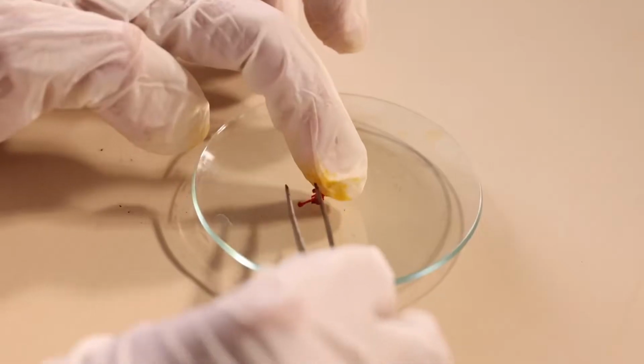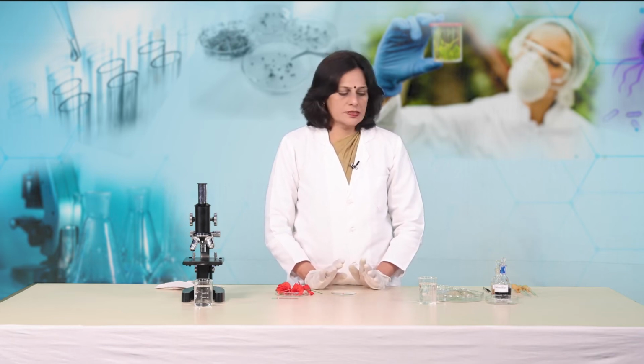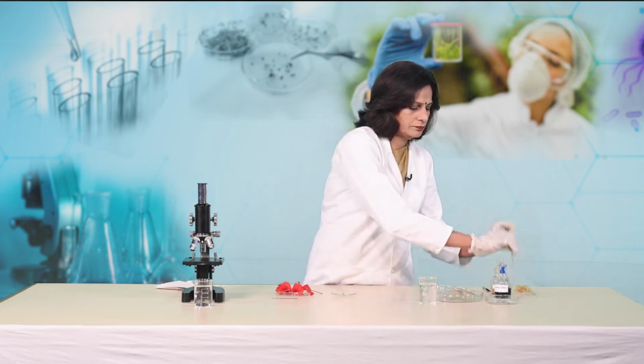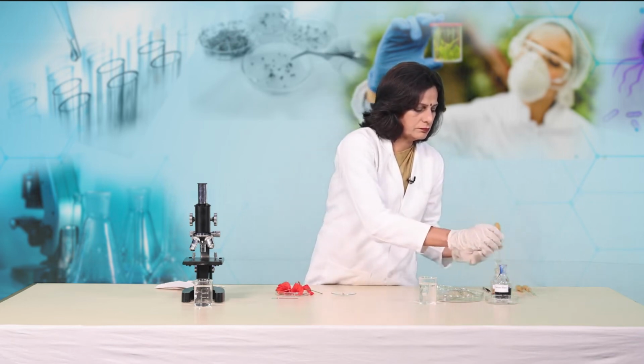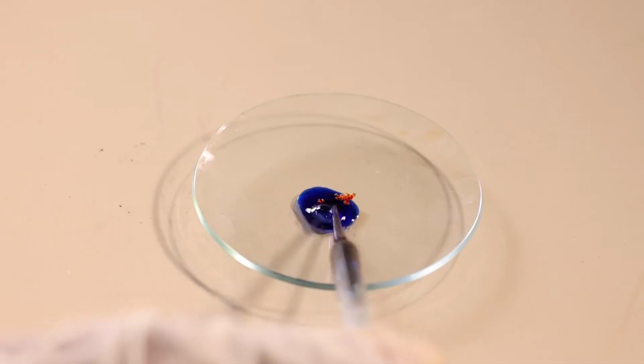After this, we will transfer it to a watch glass. Now, to this watch glass containing the stigma with a part of the style, we are going to add 1 to 2 ml of cotton blue, which is the stain, and we will leave it for 3 to 5 minutes. Now, after 5 minutes, we will pick up the stigma with the stylar tissue and keep it on the glass slide and we are going to put the cover slip.